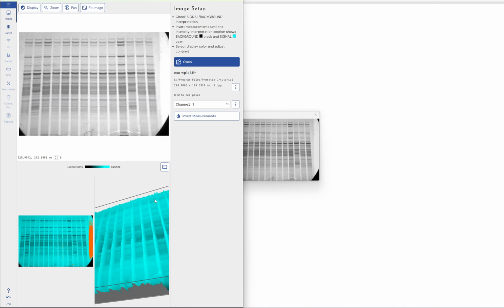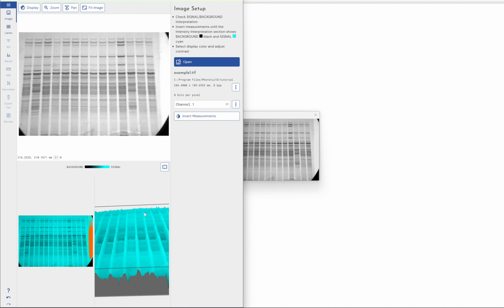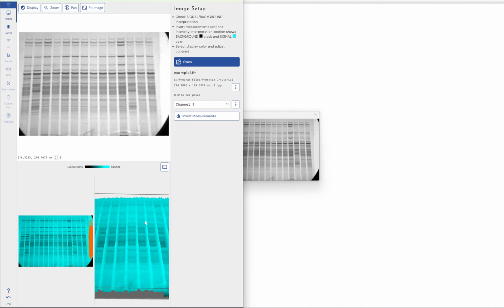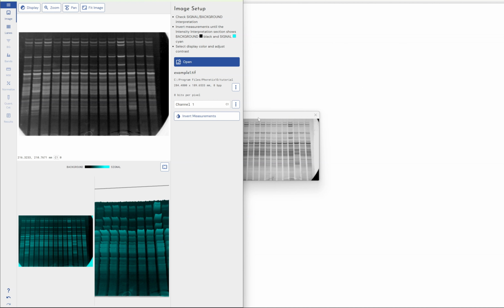However, when you open the image in the beginning, in both pieces of software, it's incorrectly extrapolated the image, or read the image to say that it's dark bands on a white background. But you can see by looking at the data that's incorrect. But we don't have such a view within GelAnalyzer. So how are we supposed to make that assessment? I guess you would have to know. You would have to be the person that scanned the image to know what it's supposed to look like.